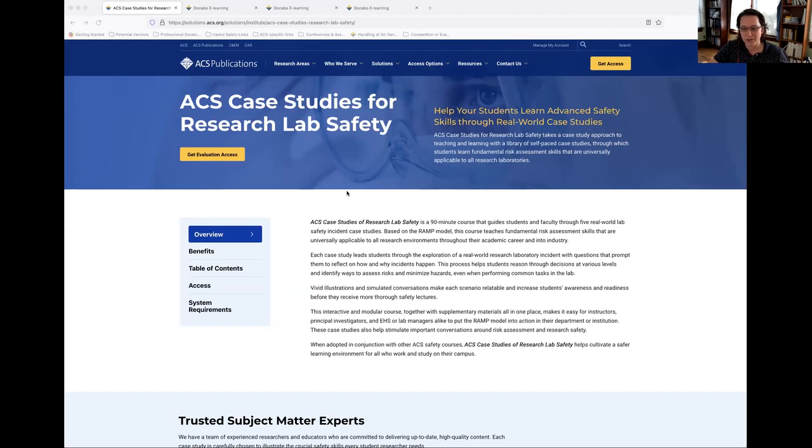Now, through our research, we've uncovered a need for students entering the research lab for the first time to become comfortable with and knowledgeable on risk assessment for independent research experiments. And while students in teaching laboratories are typically taught the basics of laboratory safety in order to work inside of labs, they are rarely called upon to design their own experiments. And as a result, experimental design, risk assessment, and safety considerations are typically done by someone else.